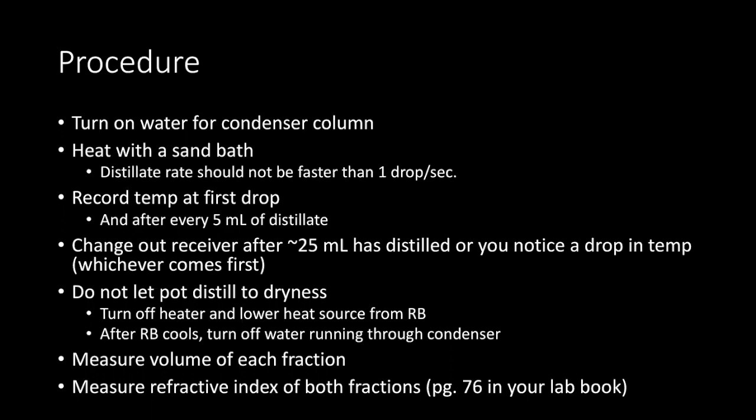Be sure once you are done, you do not let your pot or your round bottom, as it's also called, distill to dryness. Once you are done, you should have maybe 3 to 5 milliliters left in the round bottom. You're going to want to turn off the heat source, our sand baths in this case, and lower the heat source from the round bottom. Your build should be done in such a way so that you can remove the heat source without disturbing the glassware setup. Once your round bottom cools, that's when it's safe to turn off the water running through the condenser, because you shouldn't have any more vapors that need to be condensed so they don't come out into the laboratory.